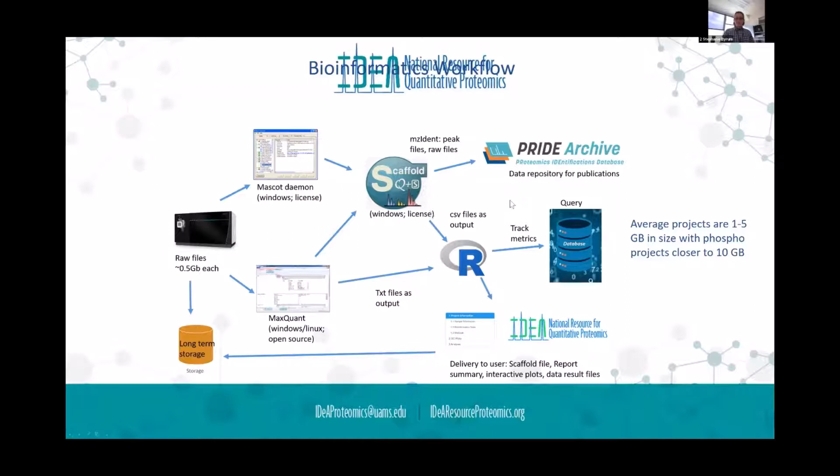So this is a workflow that I'm currently working on with the Google team in order to build cloud computing and have some more training modules too. NIH really wants to establish this training platform for various omics data sets, and we're working on a proteomics one. So if you have some ideas or anything you want to see in a training, let me know.